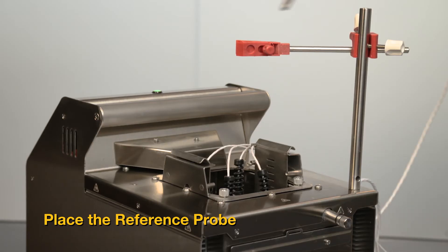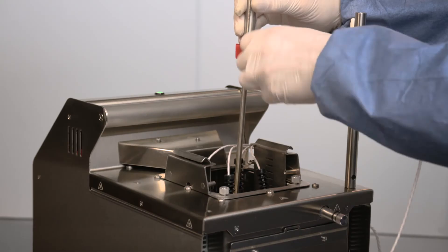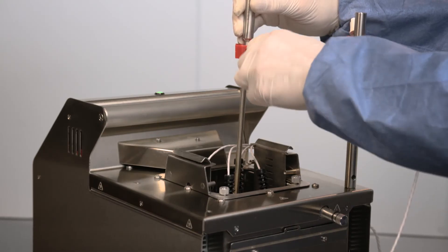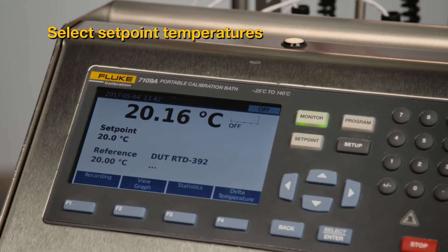Place the reference probe in the center of the working area. The optional single probe clamp kit can be used to hold the reference probe in the optimum position. On the control display, push the program button.